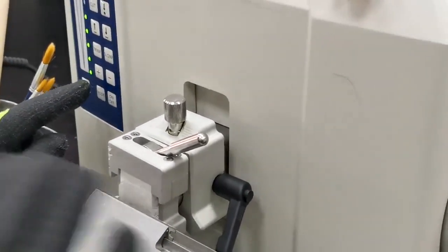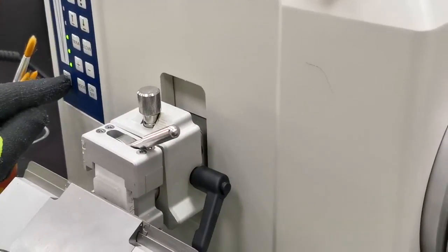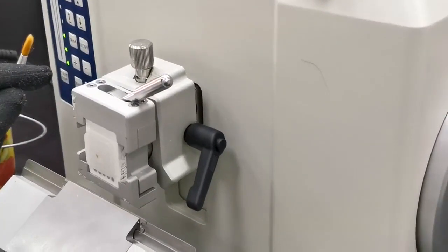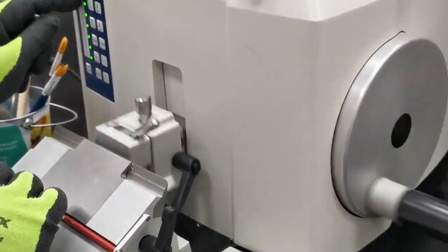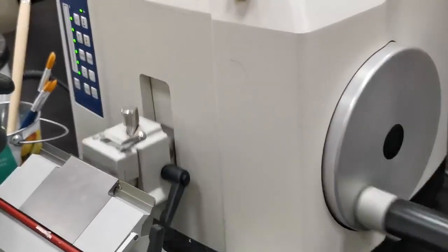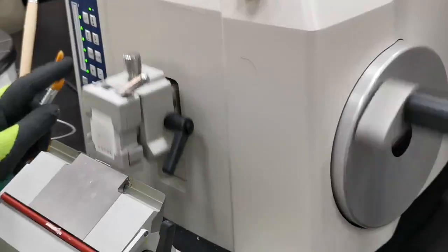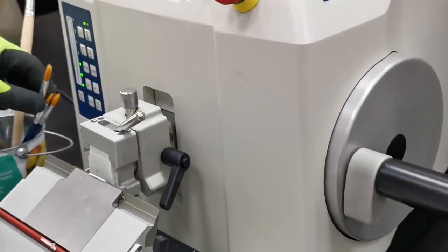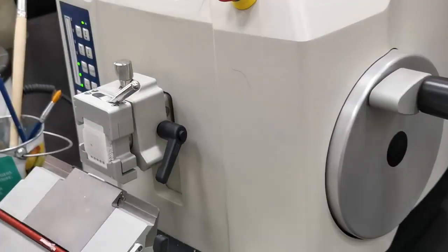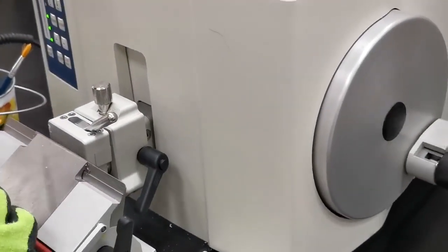Start in slow mode, then increase the speed until it reaches the surface of the block. Once it reaches the surface, slow it down and observe whether you are cutting from the full surface or only from one side of the block.